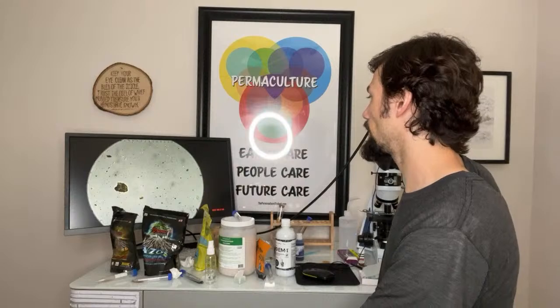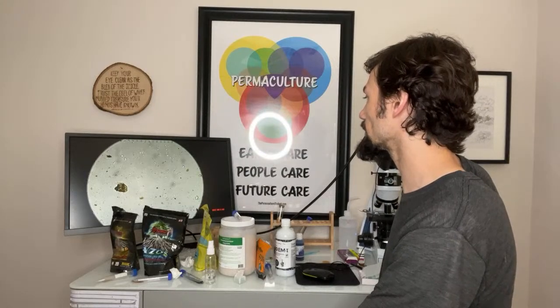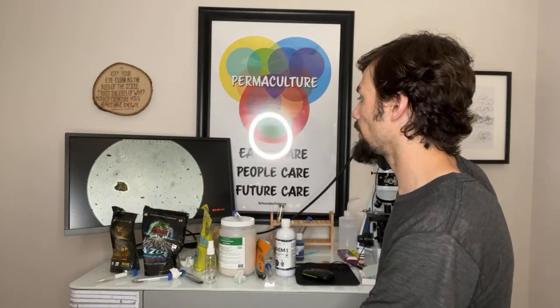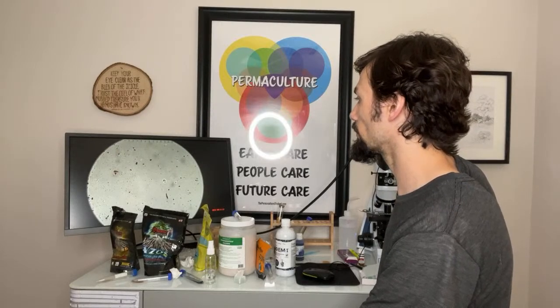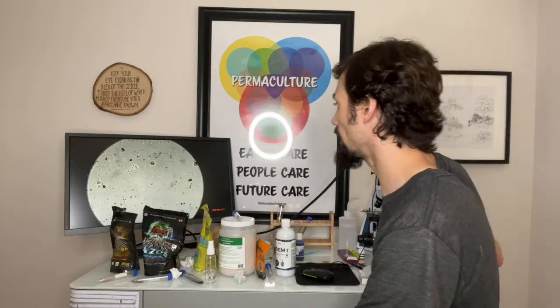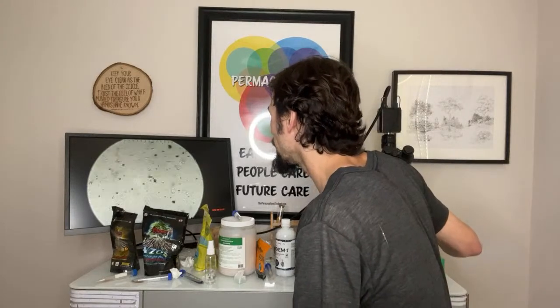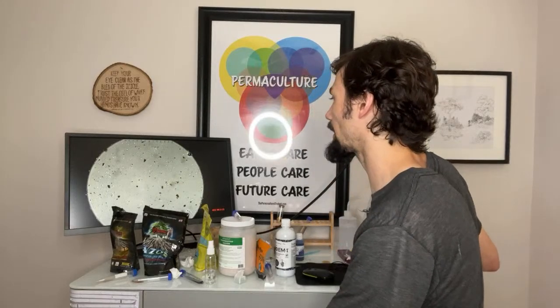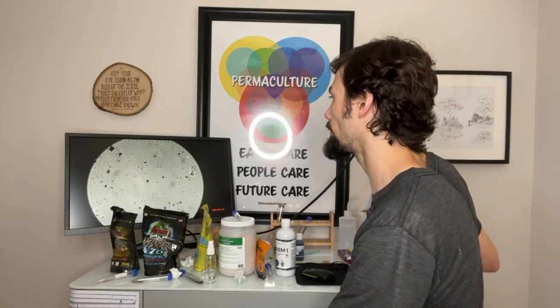So that's super interesting. It looks like a spore actually. Or could be pollen. No, pollen's usually more intricate. But yeah, it's much smaller than all the other spores. And I haven't seen any others like that. That actually could be a different kind of fungi. That could be actually more like a saprophyte spore.